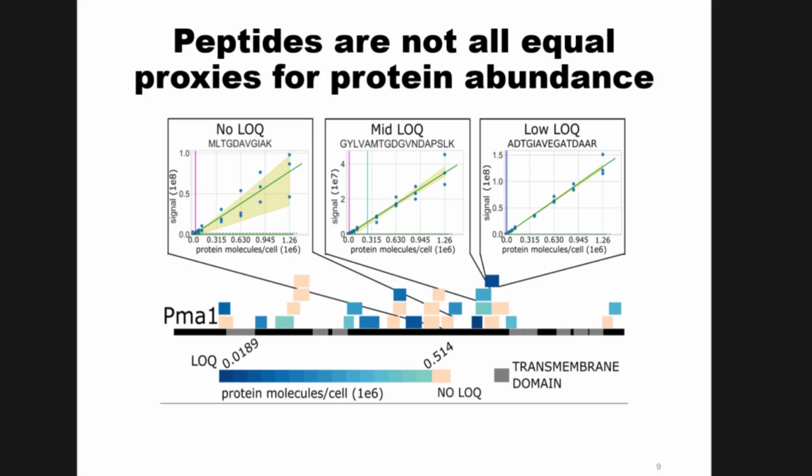Question over here? Say there's no LOQ, does that always mean that there's just a very high CV? Yeah, for this particular example, it's just that the CV is very, very high and never meets that 20% CV criterion that we talked about before. But a lot of these peptides, it just looks like I took a shotgun and blasted the plot. There's no correlation whatsoever.